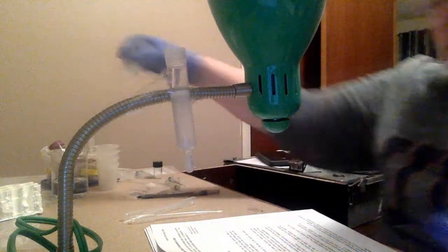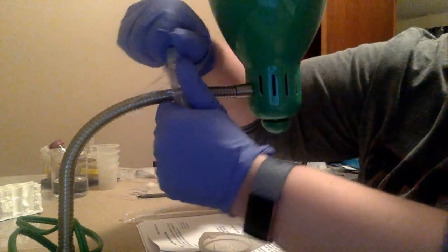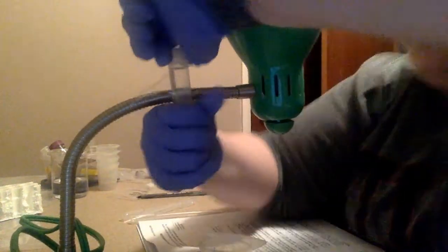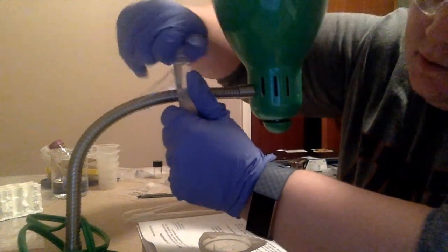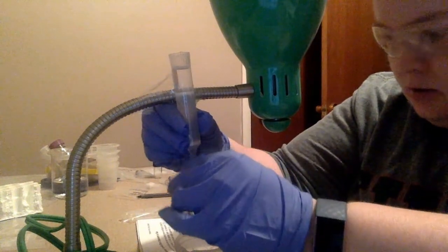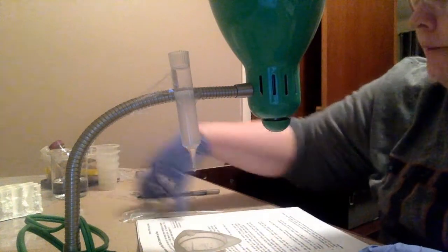This is my weird little setup that I have here with my column. Step number 1 says, remove the stopper from the top of the column and place a beaker underneath it. I should have pulled that top off before I hooked it up there. There we go. So take this off, and I'm going to have my little beaker underneath, remove the end cap, and allow it to drain. This is going to be dripping slowly.